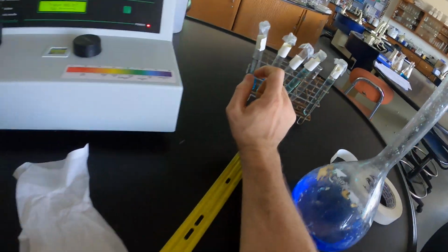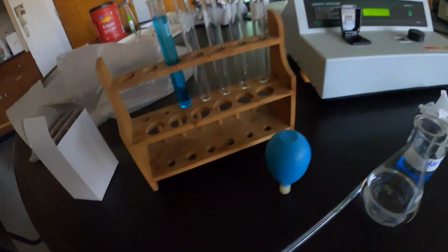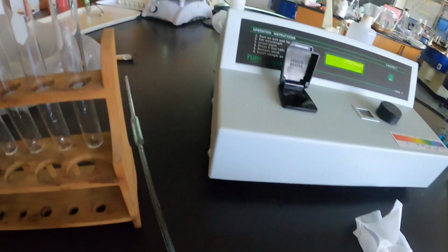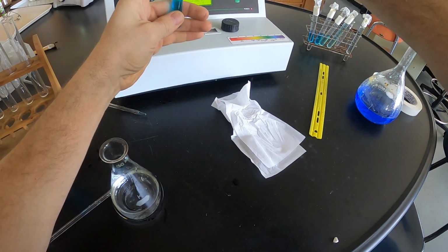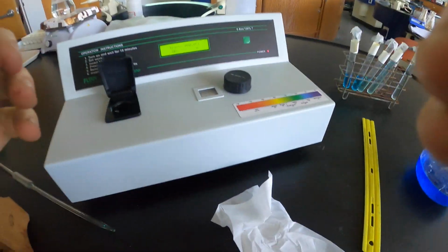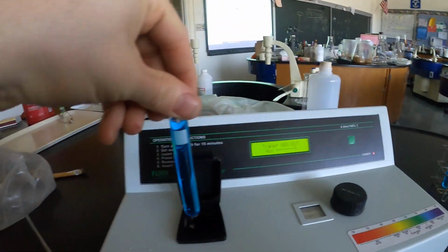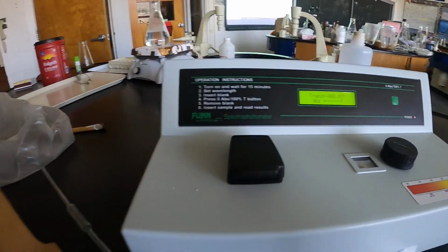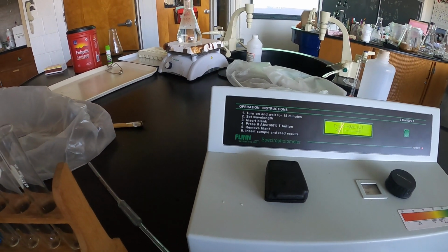When you go to start making your calibration standards, okay, you get the water out of your blank, and you fill it with a test solution, which you should start with the 0.4. So take your cuvette, fill it up, wipe it with the chem wipe. It goes into the reader, and you make a measurement on it. You document the absorbance only.